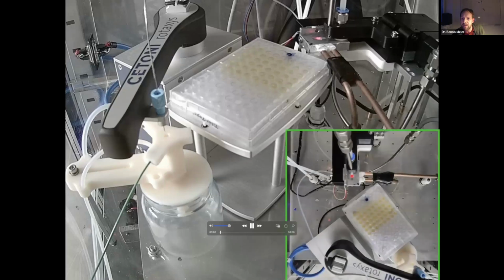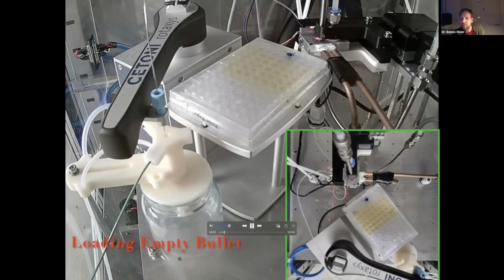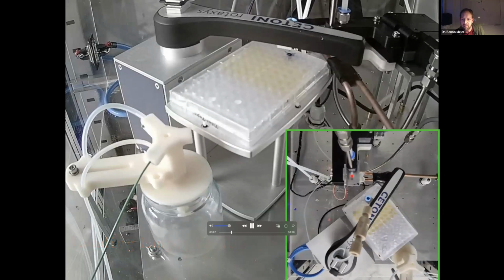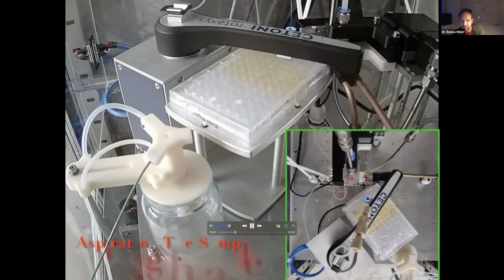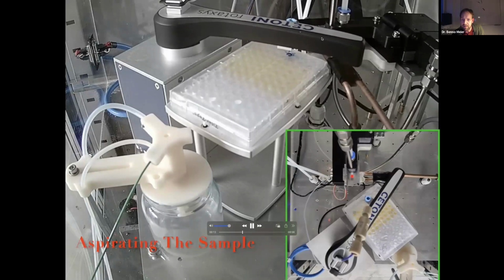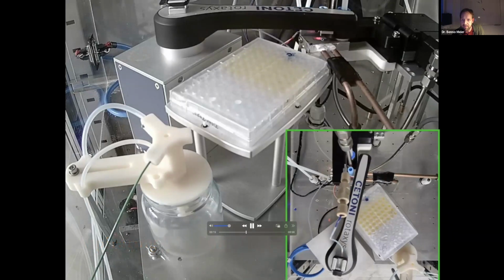Okay, so now it's moving here. You can also see a top view. Now the bullet will be in there. And then the arm comes, picks up some liquid from the well plate. And then it will dispense it into the bullet. Like that.